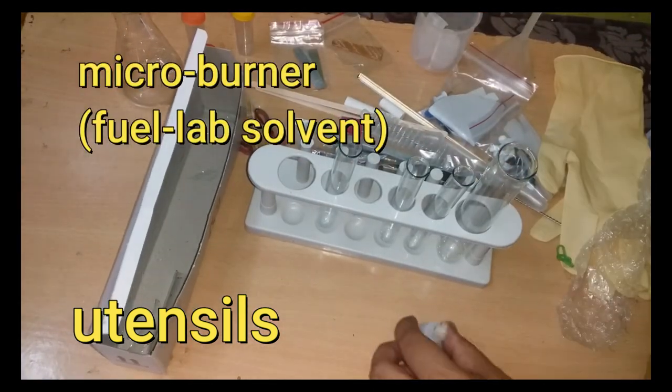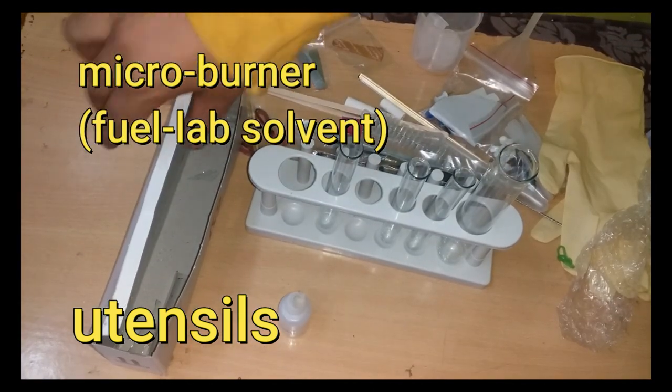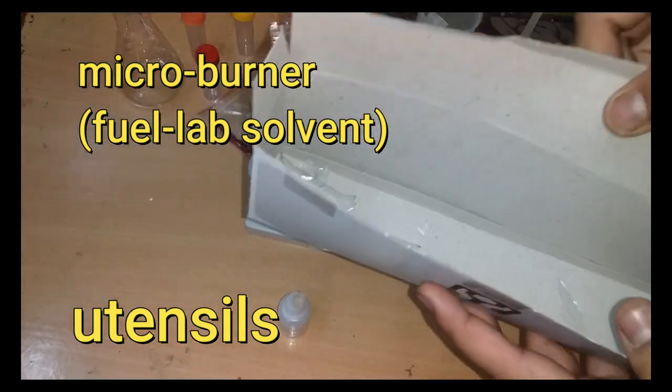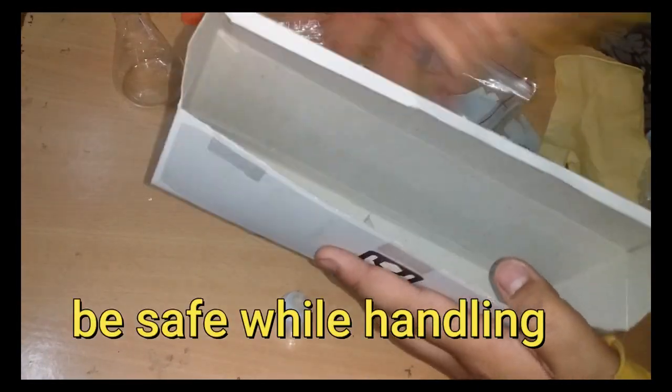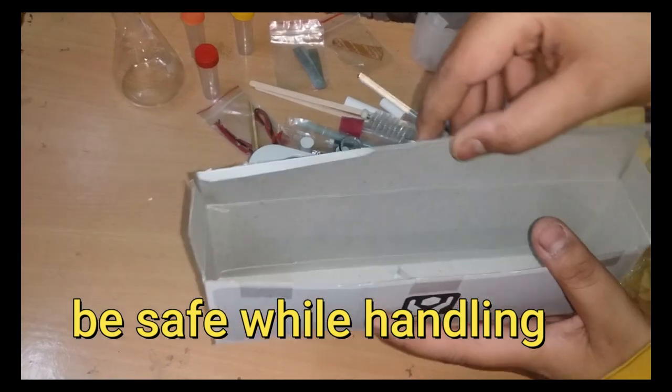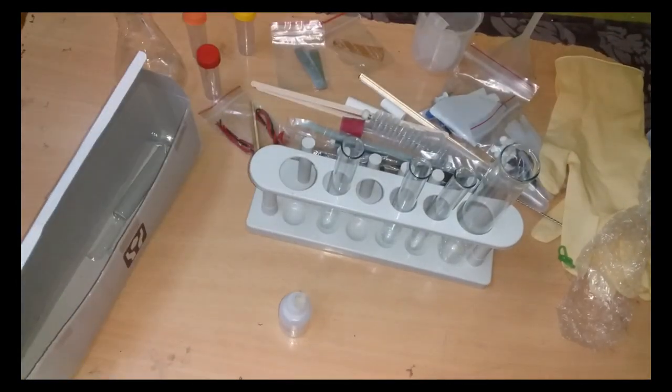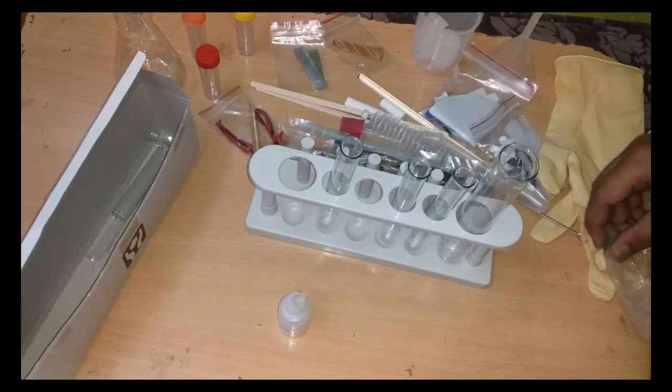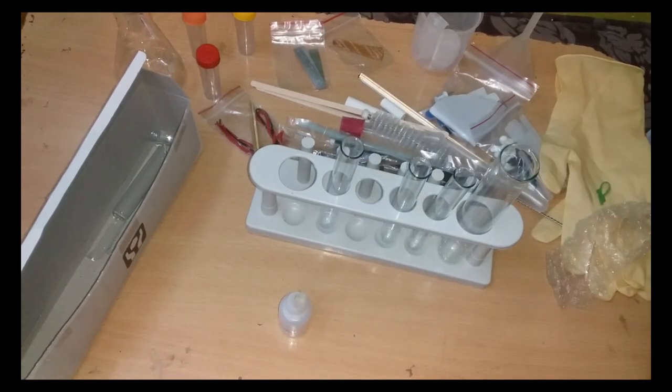And this is a micro burner which can be used, and the fuel can be the lab solvent. Be safe while handling these because they can be broken and can hurt you. Bye for now, we'll meet you tomorrow.